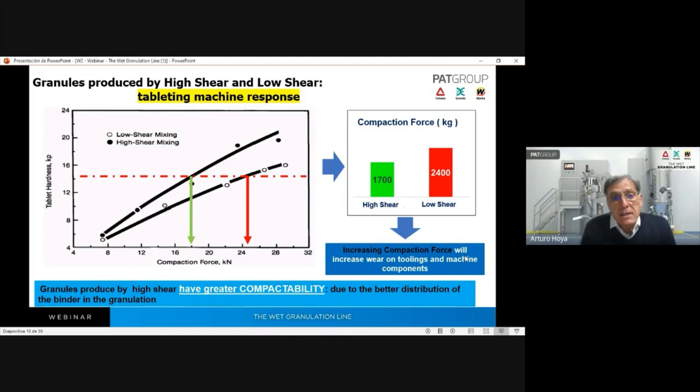The methodology implies weighing X grams of granules, putting them into the friability machine, and adding spheres of glass or spheres of steel. Then you run the process for 100 revolutions, weigh again and calculate the loss of weight, and you will obtain a percentage of friability.